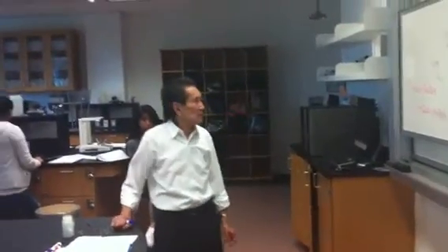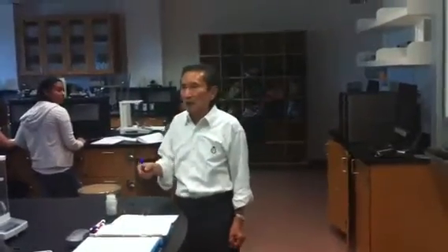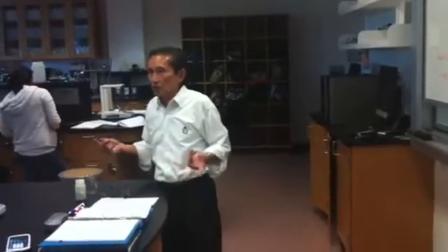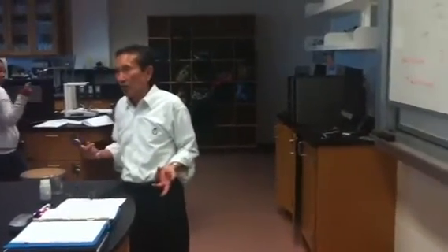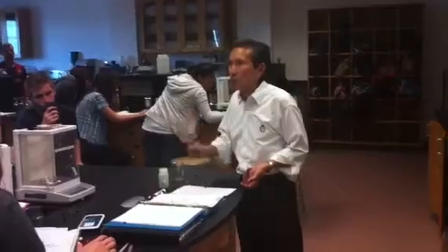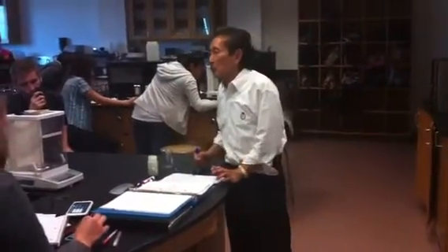Okay, you added 2 grams, but do you know it's exactly 2 grams or 2.1 grams or 1.9? You don't know. You have excess. 2 grams is excess zinc, too much for the reaction. So how do you remove the zinc?